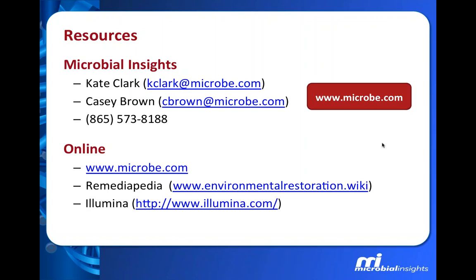Is there a specific DNA, RNA extraction kit that you prefer? That is really related to labs and their hands, what they do. There's a lot of good ones on the market. Mobio has a lot of good kits. The problem is I don't know any kit that I take off the shelf that I think does an excellent job of doing the extractions. All of them we've modified here in-house and combined methods and done our own modification processes to make them better kits that can isolate more high quality DNA. So unfortunately, I don't know anything you can just pull off the shelf and use.